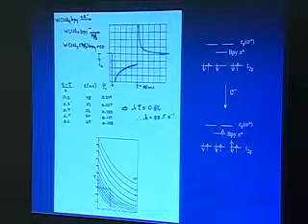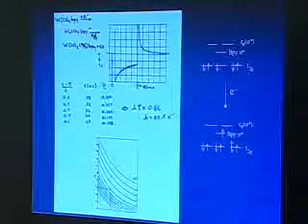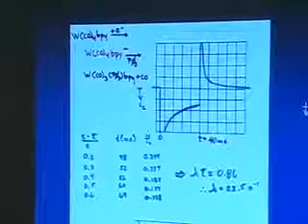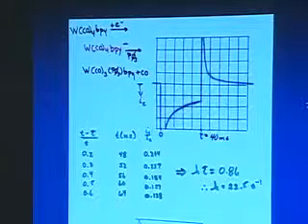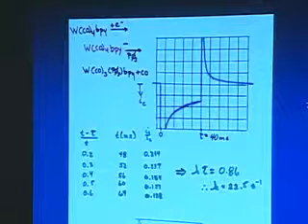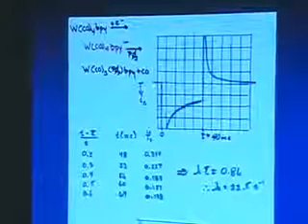Now, I could not have done all this unless I knew the part that I pinned in there first. That is, what working curves I should have used and what I should have jumped between would have been unknowable unless I already knew that when I dumped an electron into this system, first I reduce the complex and then a CO ligand falls off. I need to know that first. And so how did I know that? Because I'm certainly not going to figure that out by looking at a set of curves that looks like that. And the answer is we did cyclic voltammetry to start with. So this is the study before the study.